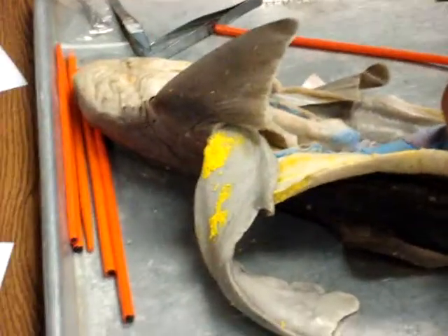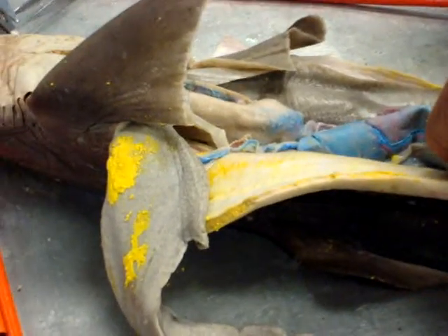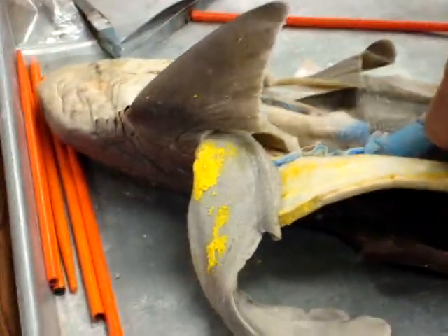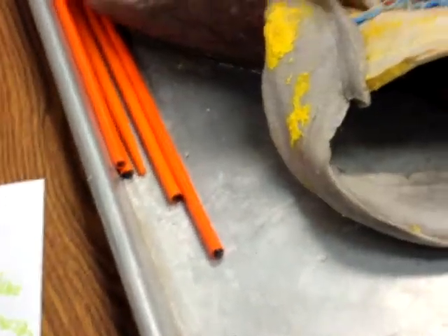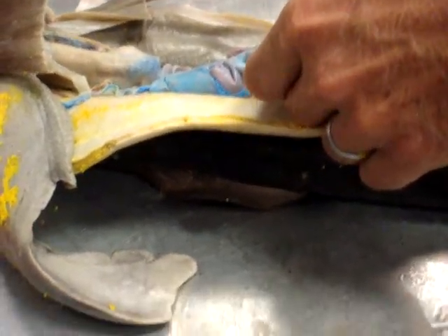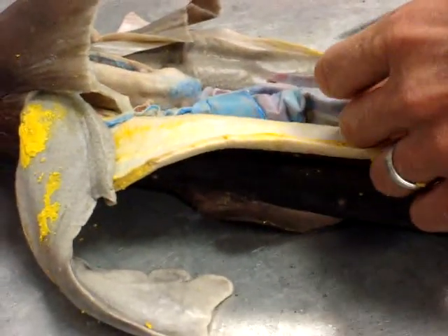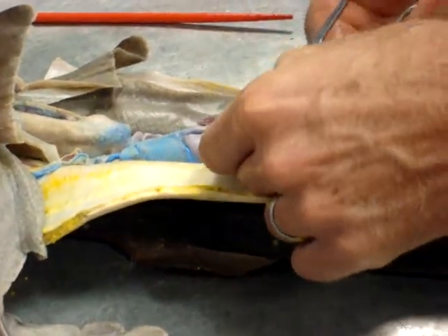We'll get it while you're cutting. Yeah, okay, valvular intestine. Oh, that's this guy. And then we're going to talk about the spiral valve next, probably. Spiral valve, there we go. Okay, so the majority of the absorption of nutrients, just like in humans, takes place in the small intestine. In sharks, it's highly specialized. We have a special part of the intestine here called the spiral valve, which is very apparent once we get inside of the... Question, small intestine is a really, really big thing. Yes. It's ironic that they call it the small intestine because it's actually pretty massive. Looks like it got some more digested food in there. Yep. You should touch it.